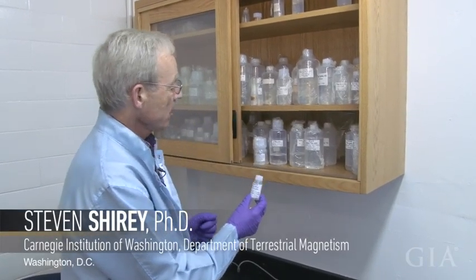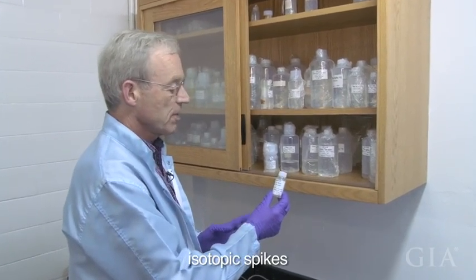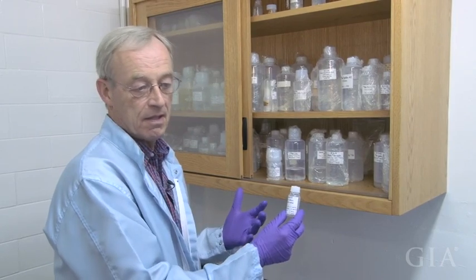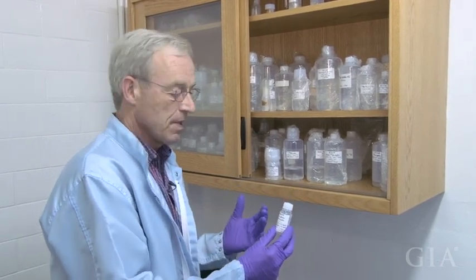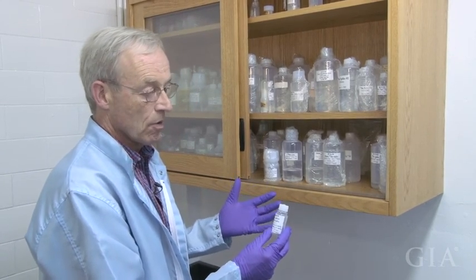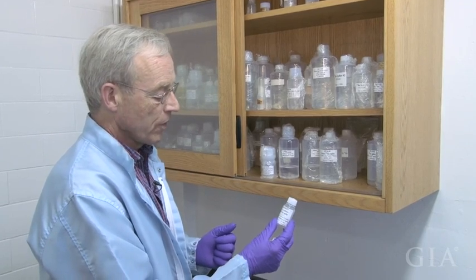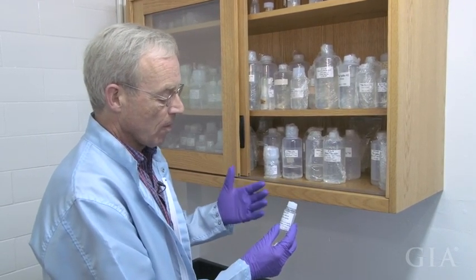What we have in this cabinet here are what we call isotopic spikes. These are enriched solutions of one isotope of the element of interest for the analysis. They're not the isotope that's the radiogenically derived parent or the radiogenically decayed-to daughter. They're usually an enriched normal isotope.